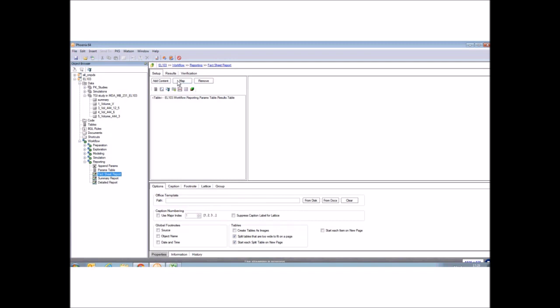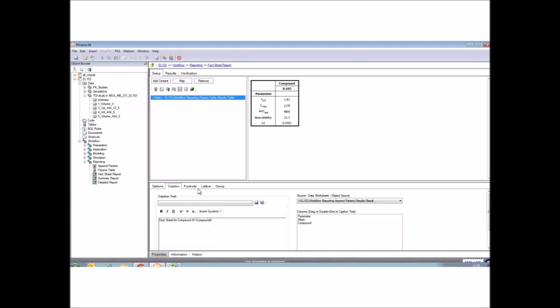And in order to turn it into a Word document, there's this reporter function where you can pick objects from any of those workflows, and this shows you the object display, but what it also has, it has some context-sensitive information. So, for example, you can apply headers and footers with some object-specific information, this is context-sensitive. So this object comes with information about some parameters, mean values, and the compound itself.